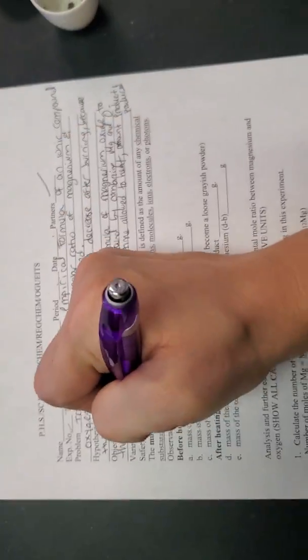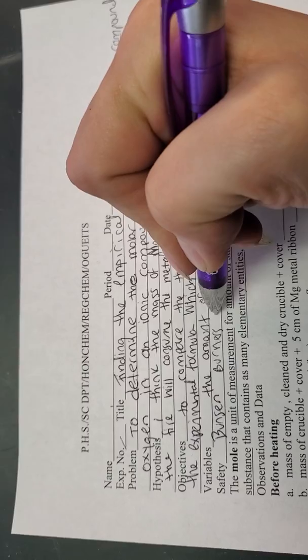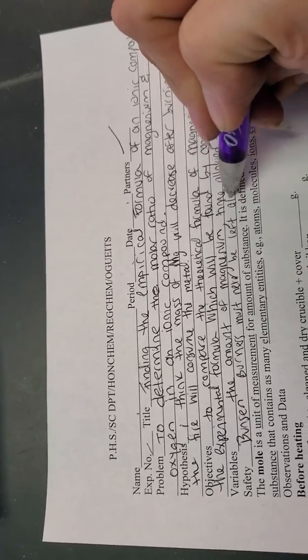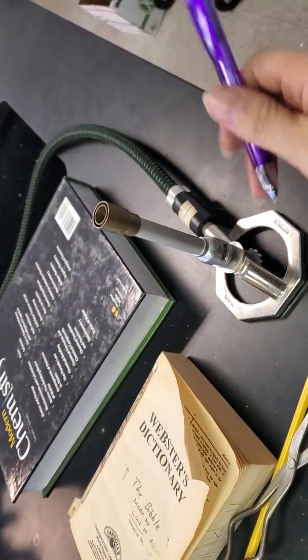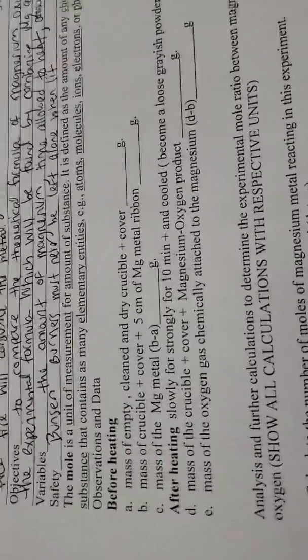For safety, Bunsen burners must never be left alone when lit. Okay, so when we're working with Bunsen burners, this little piece of equipment, if this guy is on, if he has fire, we always have to have an eye on it. Can't leave it alone.